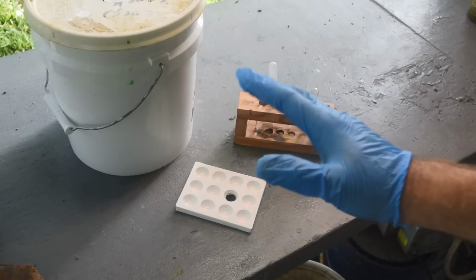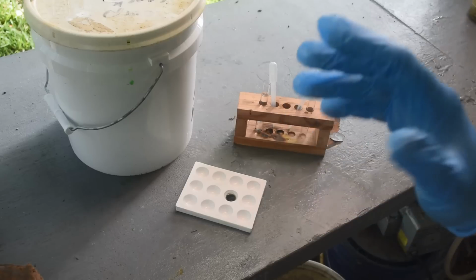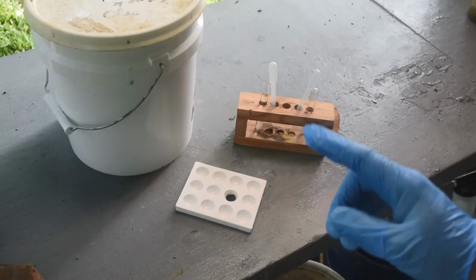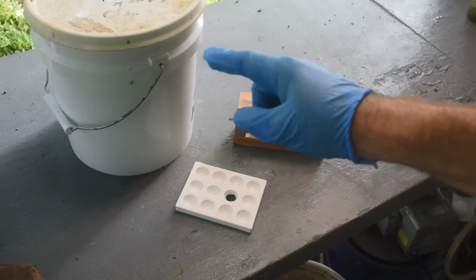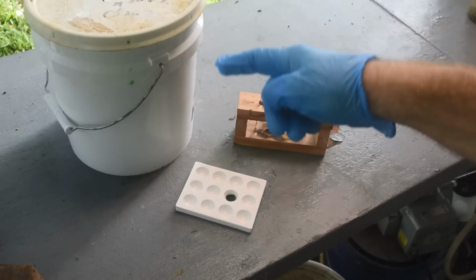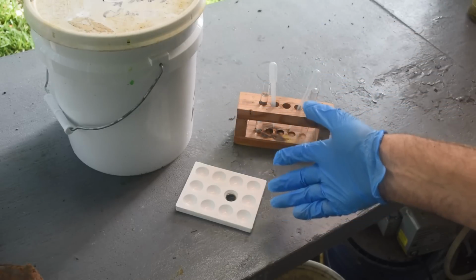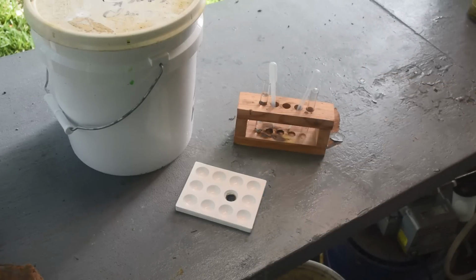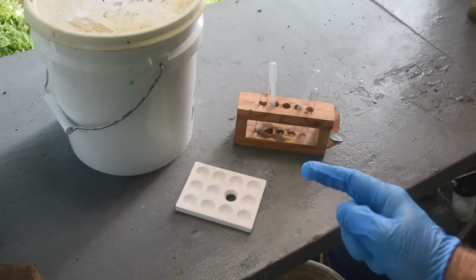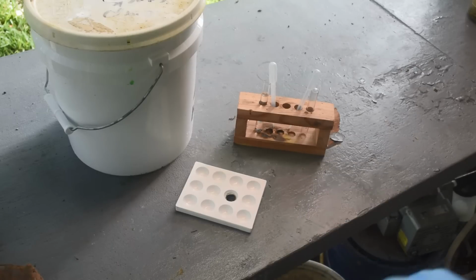Okay, because this has been a process, let me tell you, a process. So I think I'm going to stick to recovering the palladium for now, and I'll think about what to do with the gold in here. All right, but yeah, I don't know if I want to deal with trying to recover it. It looks like maybe a decent amount of gold, but from two gallons of liquid, when I can just throw it in my temporary stock pot and let it settle out over time and get it as a scum off the bottom, that might be the best way to go. Let me know what you think. What would you do in this case? I'd be interested in hearing. All right, let's get back to the palladium.